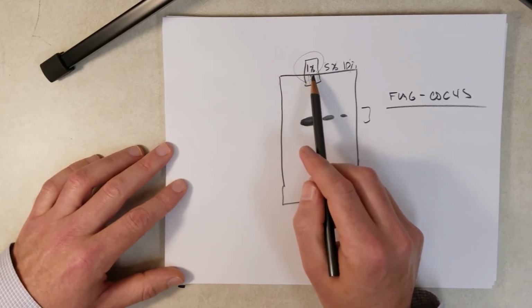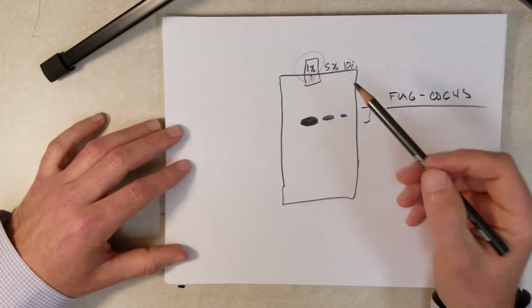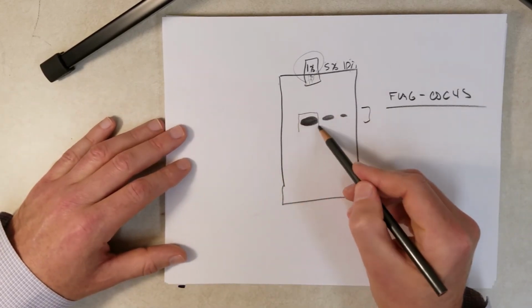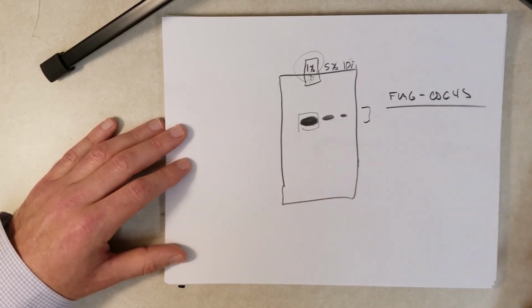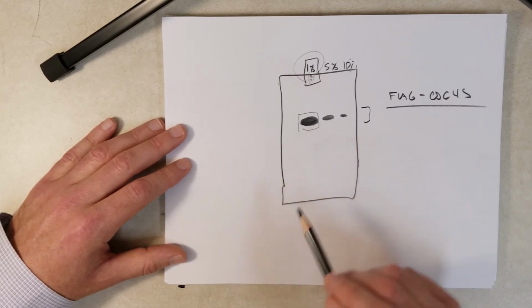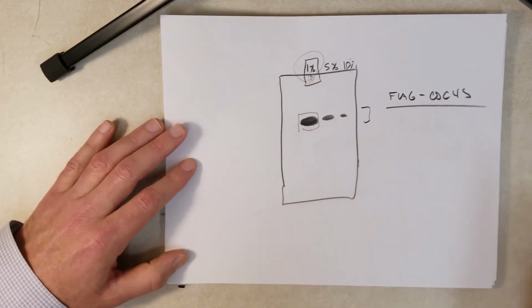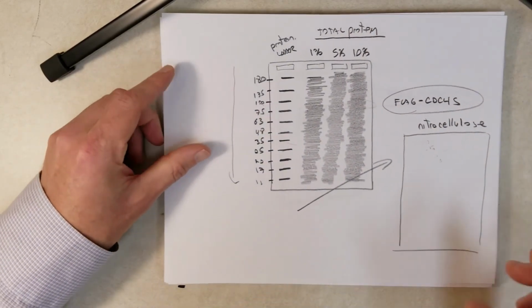This is the one we would want to use to make a really large culture of cells to collect the most of this protein to put through that immunoprecipitation process, so we could collect a lot of it to do our studies on replication.